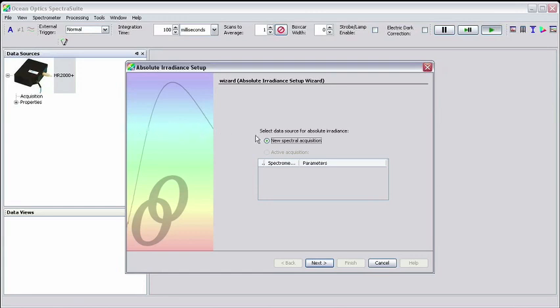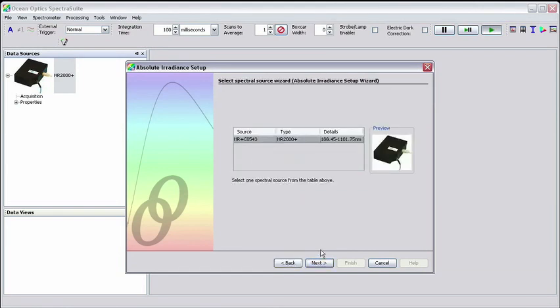Select New Spectral Acquisition and then click Next. Make sure that your spectrometer is highlighted. This indicates that this is the source of spectral data. Now click Next.